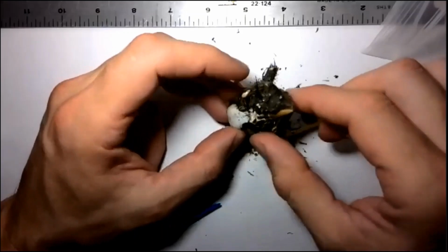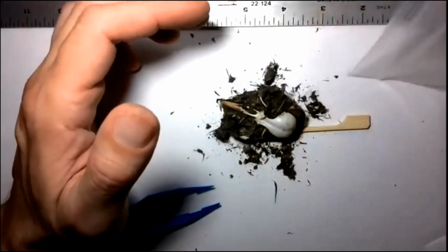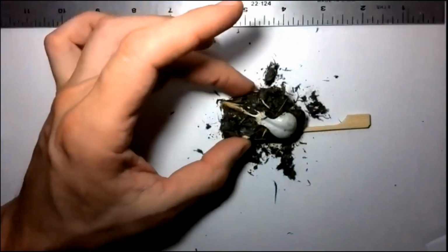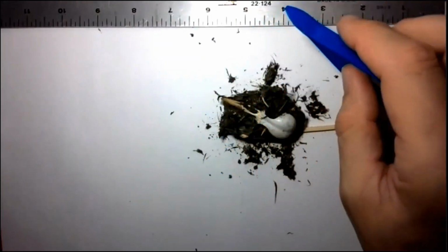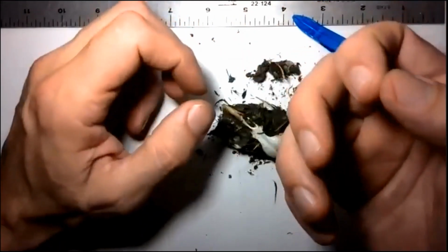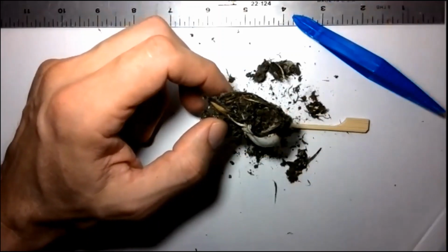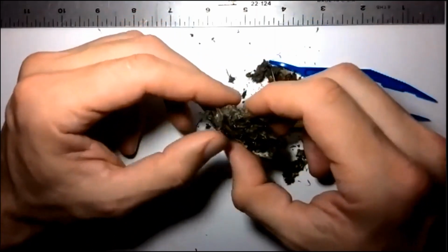And I'm cutting this open. Oh, this is a very compact one. One important thing is these owl pellets have been packed in a facility and they are already sterilized. If I were doing this in the field, which I have done a couple of times, when you find an owl pellet in the field, I would put on rubber gloves just in case, because there can be contamination of bacteria and some nasty stuff that can get under your nails. You don't want to deal with that. But in this particular case, because the company OVDK supplies these pellets, they're already completely sterilized, so I have no problem. I just do this with my bare hands.